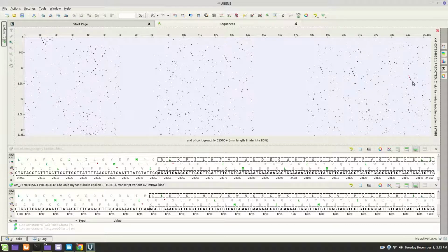So you say, okay, here is a piece, this is the piece I think is an exon. And I think if you meet the criteria for the splicing site, which this might meet right there, I think, then yeah, this is the beginning of my exon, and then you go to the end, you meet the criteria there, you go, that's the end of my exon, the rest of it is intron.